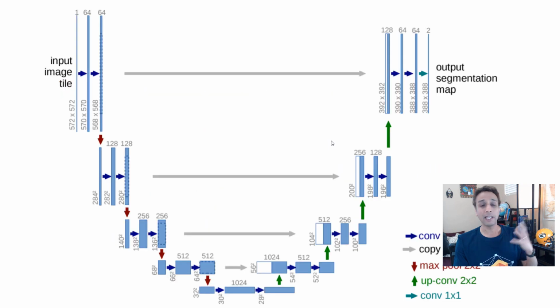Now, just at a high level, what is UNet, right? It's called UNet because the architecture is in the form of a U. The input image goes in, and then you see these 64 filters, and then 128. As you can see, this gets smaller and smaller, and this gets wider and wider, and eventually the entire information is almost encoded.